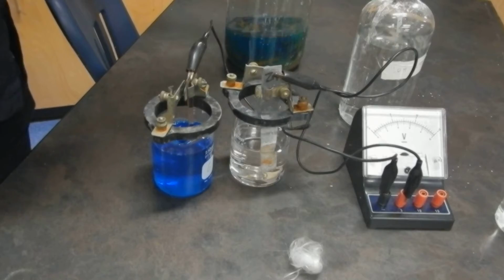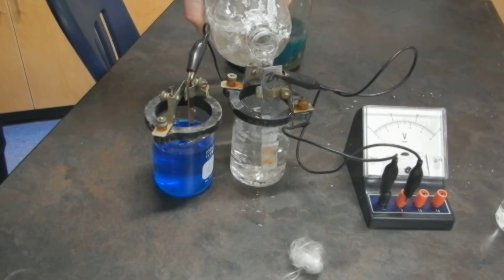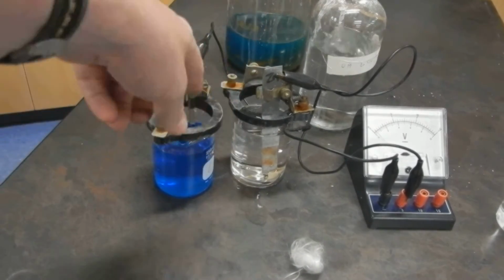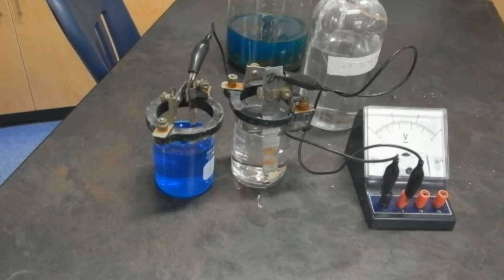Oh, I better put a little more of the zinc solution here. Okay. Now, I've got wires to a voltmeter, but nothing's happening because I haven't connected the 2 half cells. So I have to have my electrolyte.